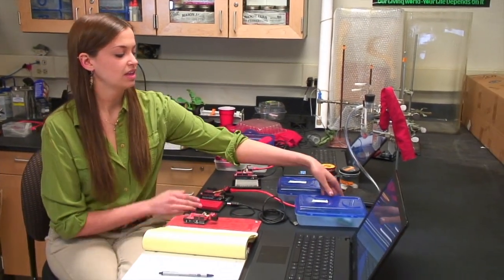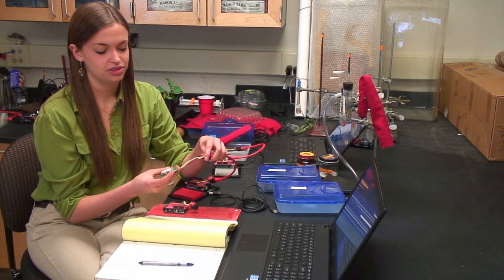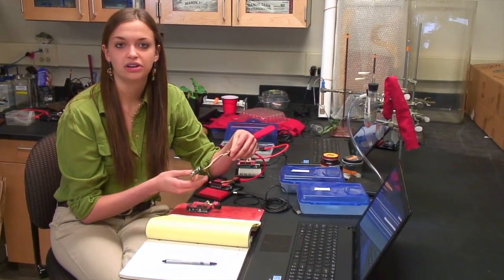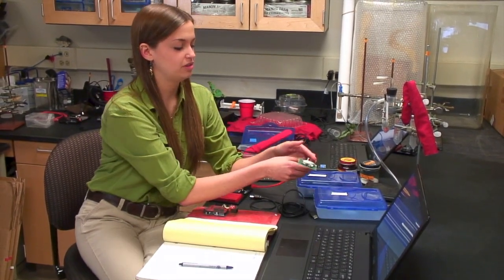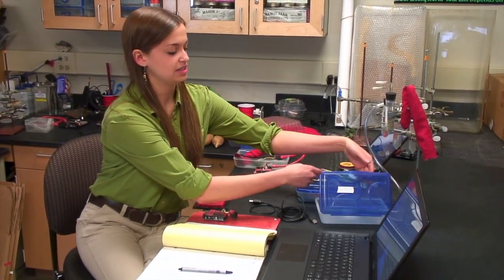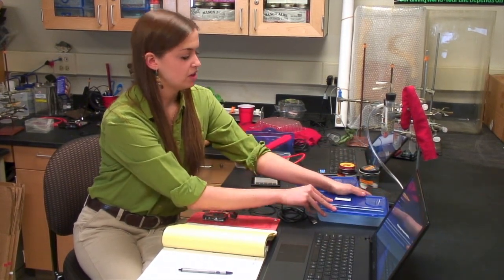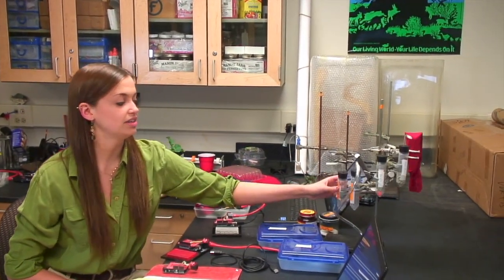From there, the Ethernet cable is running into our chamber. Inside of our chamber, we have the K30 CO2 sensor and another setup connecting our sensor back to our Arduino with the transmit, receive, and the power and 5 volt. We keep this inside of our chamber here. From this, we have our tubing connecting to our yeast.